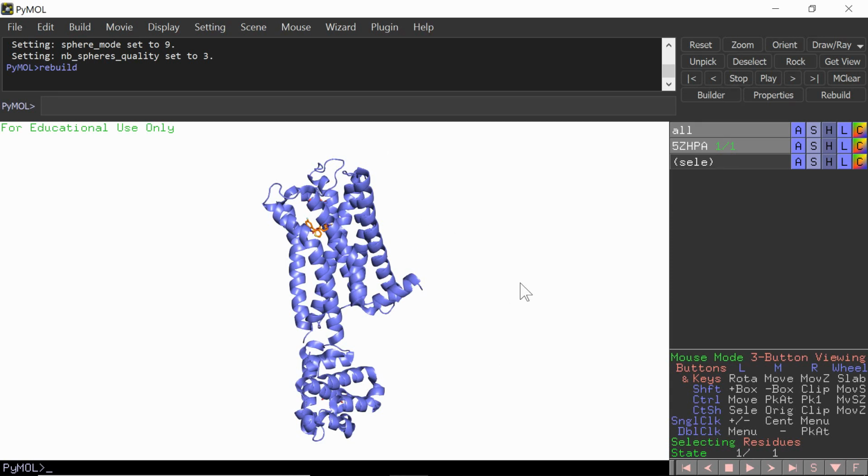In addition, the directionality is being utilized here to emphasize that the extracellular portion is up and the intracellular portion is down, making it more apparent which is which.